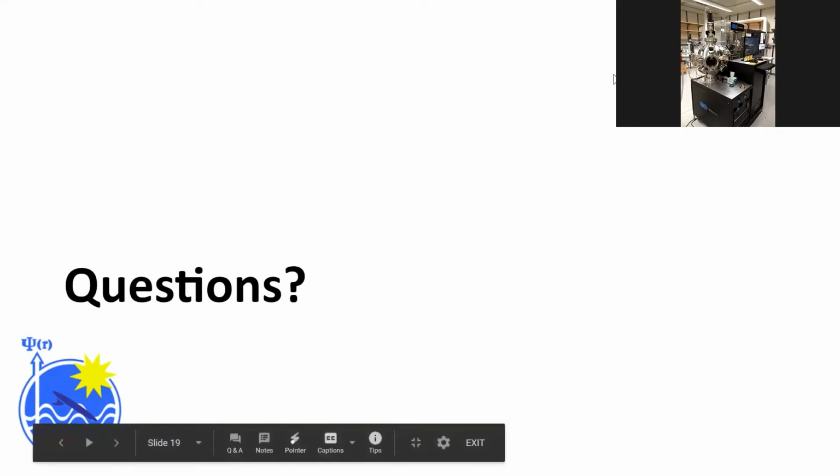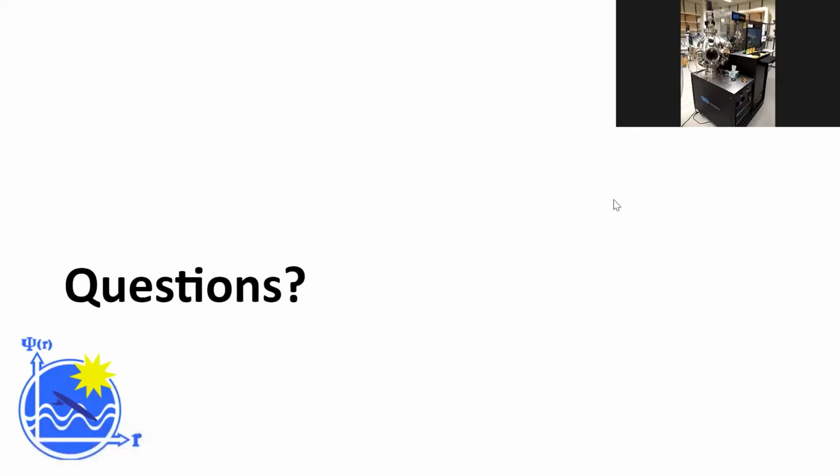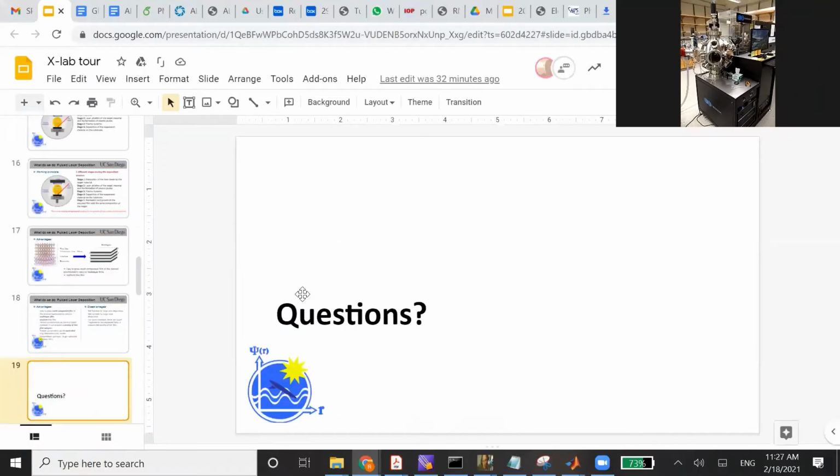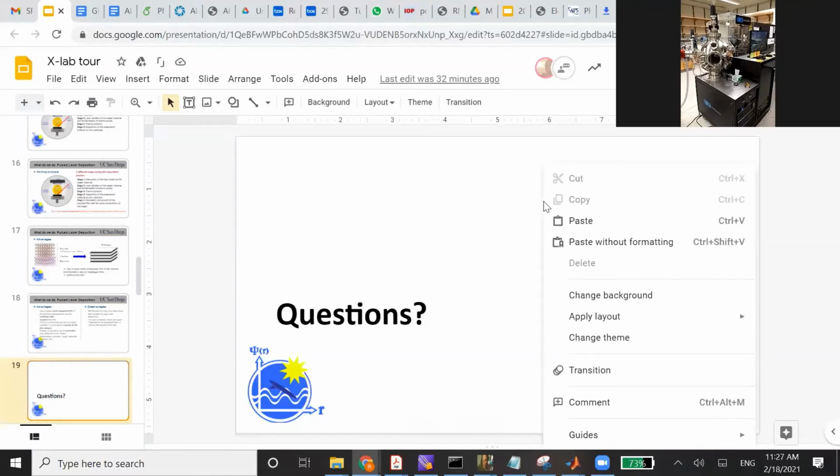I'm showing our PLD lab. So, Don, can you please stop sharing? I guess maybe then this will become the main screen. Okay. Is everyone seeing it?